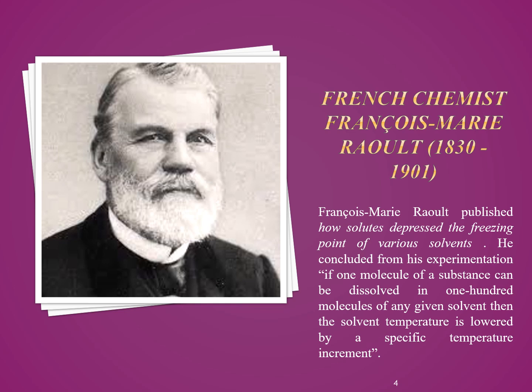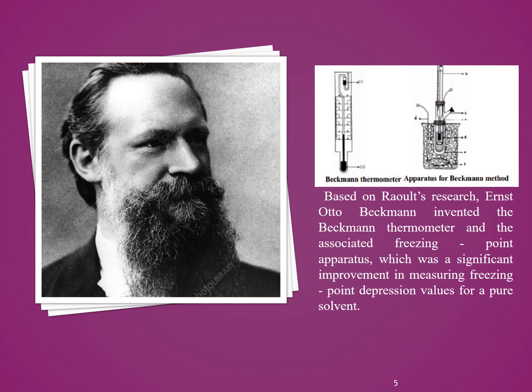He concluded from his experiment, if one molecule of a substance can be dissolved in 100 molecules of any given solvent, then the solvent temperature is lowered by a specific temperature increment. Based on Raoult's research, Ernst Otto Beckmann invented the Beckmann thermometer and associated freezing point apparatus, which was a significant improvement in measuring freezing point depression values for a pure solvent.